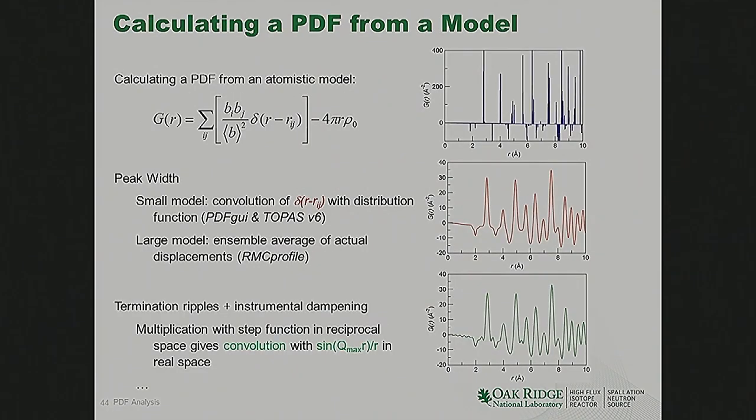In a few more steps, if you do what I just said, you'd get a function that looks like that. Okay? You have a delta function at all the distances as a function, and you know how many of each number you have because you're dividing by the average. What you need to do, there's two different approaches. And there's variance in those two different approaches.